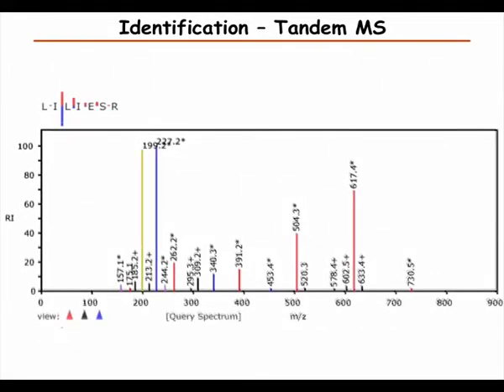And so what we want to go from is that we want to be able to label all the peaks, whether they're Y or B ions, and between which amino acid the fragmentation happened. And we want to be able to annotate the sequence and show how much evidence we have for fragmentation between different amino acids.